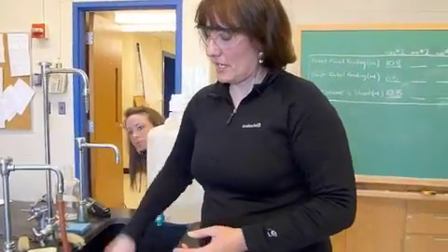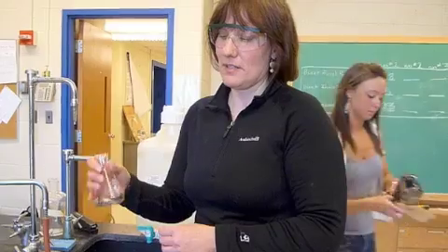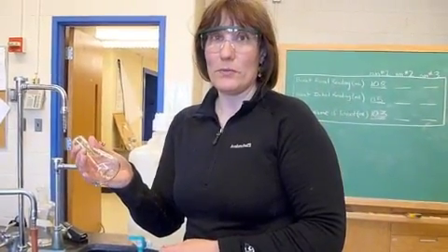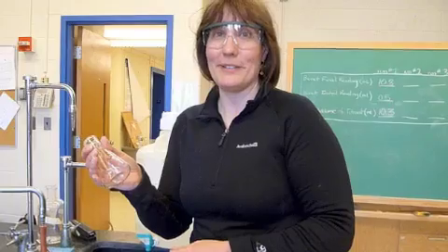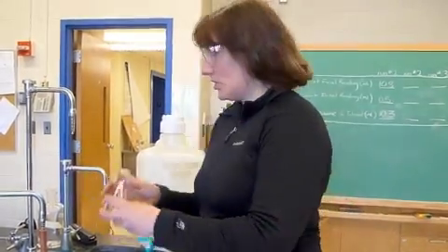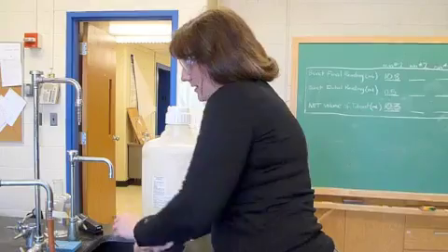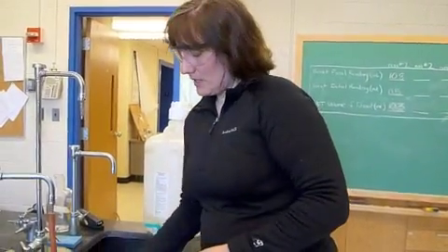If you're not careful to get all of the solutions out of here, your reactions will start to happen without you doing anything. So you want to make sure you thoroughly rinse this, give it a good swirl, just dump the water.